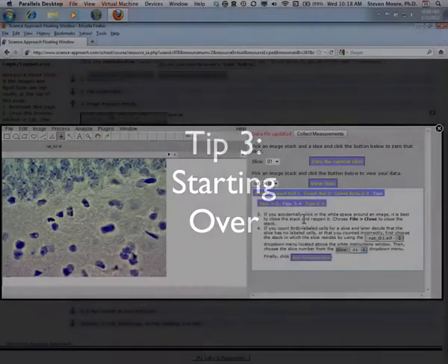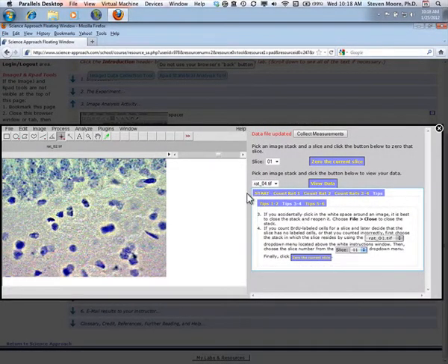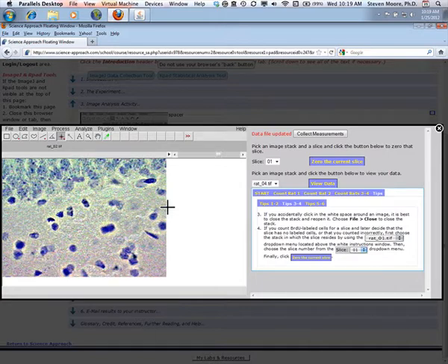If you click in the white space outside of an image or click too many times in the image, it's best to just start over. Close the stack and reopen it.